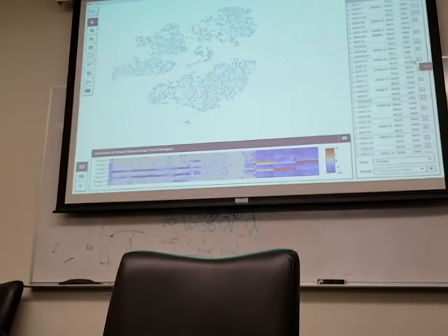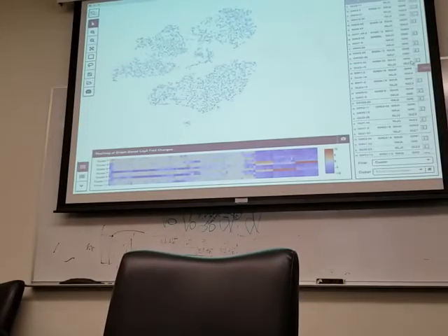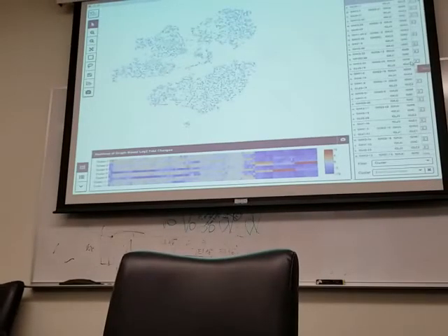Okay. See, I don't care what everybody did before. The CDR3 region has high somatic mutation. That's really important. It's long. Right, so it's a question of gene usage then. Why do they come up with this thing? Because they twist and squeeze the data, and they have diversity. And I know what Harry Schrader does. They have diversity region data. That's it. We're going to make something out of it, because we're not going to do all this sequencing and come up with nothing.